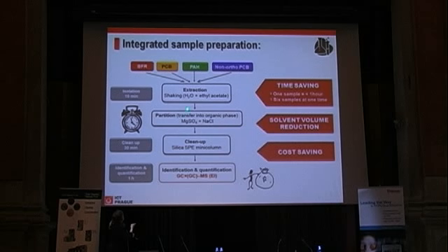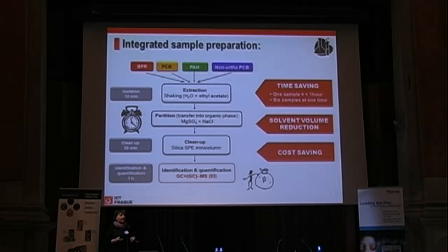And then, of course, you have some fat in your ethyl acetate extract, so you have to move to some small SPE. And at that time, at the beginning, we ended up with GC×GC with MS. That was the start of the project. And you also may notice the comments I gave here: the sample throughput using this approach was enormously improved and increased. It was really a pleasure for the lab to have that.